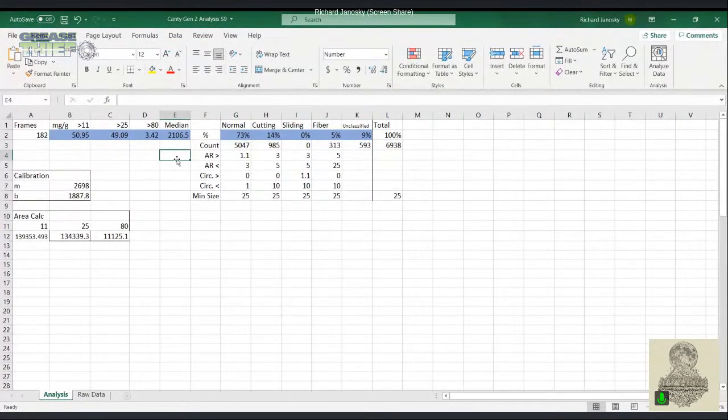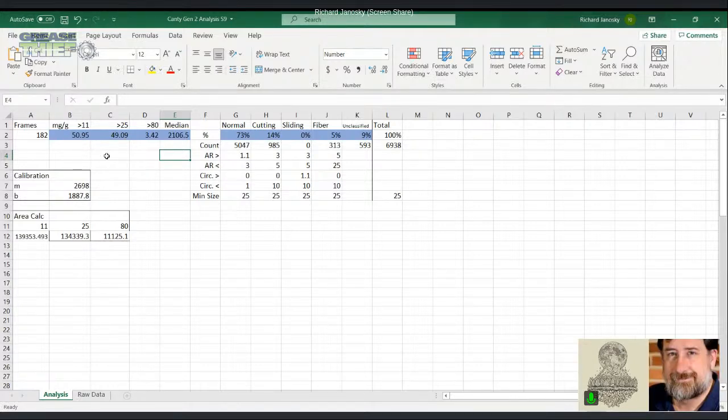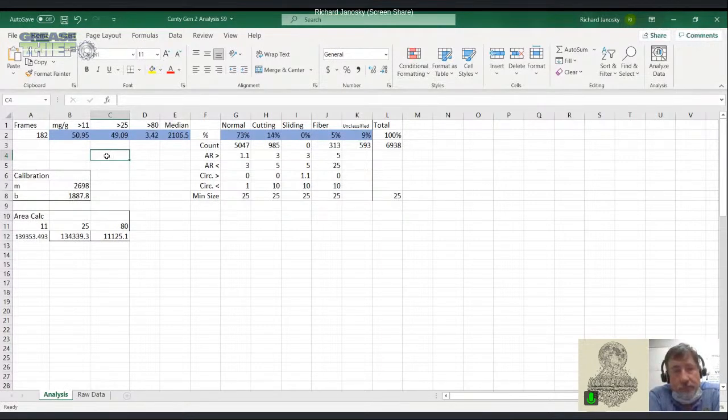So this is helpful, because over time we would be able to trend this. If we're sampling something biannually or annually, we can perform this with our sampling, and over time we're able to see whether the particles we're seeing are continuous, or whether there is some kind of change. That allows us, as we've talked about before in boot camp, to take action and evaluate our lubrication program and frequency.